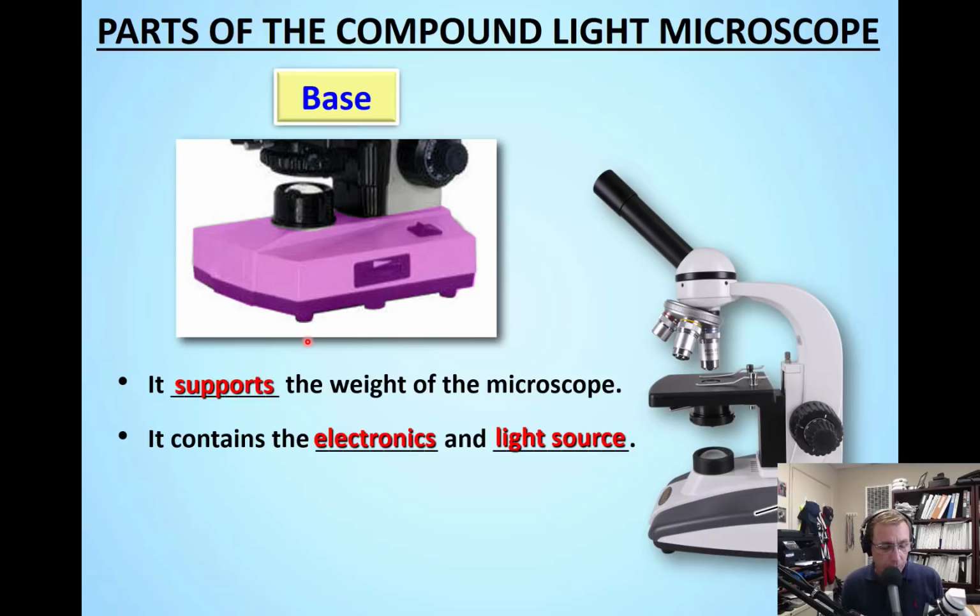And on some of the microscopes, the adjustments are going to be electric adjustments. There are motors, but ours aren't. Again, the student ones are not that fancy. In fact, if you look here on our actual microscopes, you'll notice there's just one knob. So we actually don't have a fine and coarse adjustment knob, but they are on the teacher one if you remember back. Oh, and ours have the adjustment on both sides. That's kind of nice.